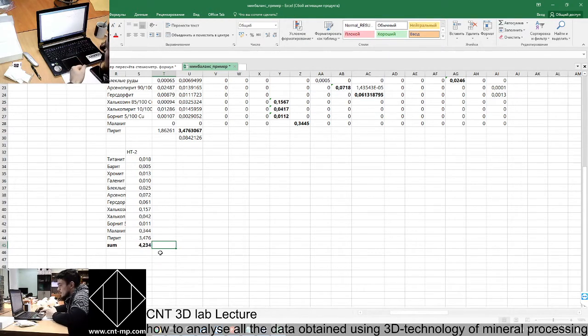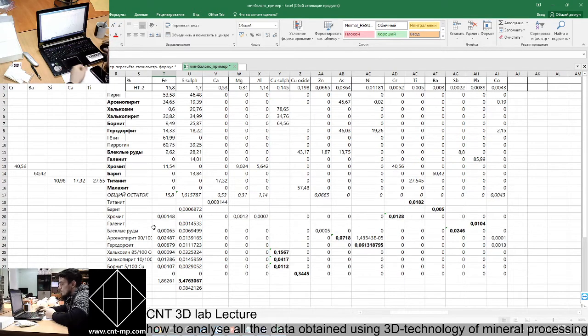That means that the other 96% consists of non-ore minerals. They consist of light minerals like quartz, like plagioclase, like pyroxene. Some of the pyroxene are really heavy too, but we are using ore microscopy to detect the real minerals which bear real mineral resources, you know.